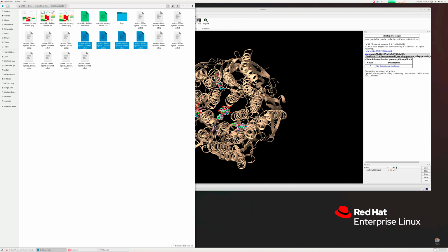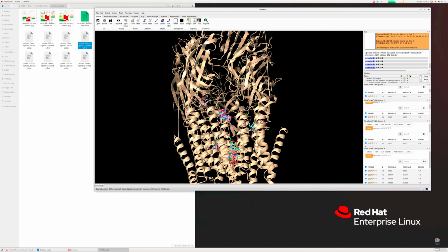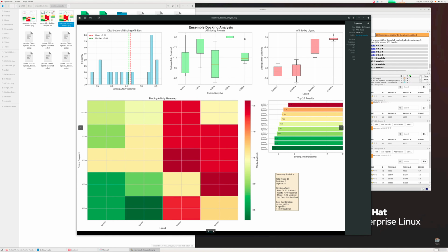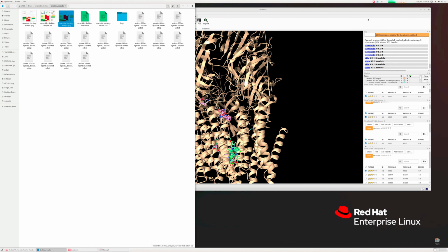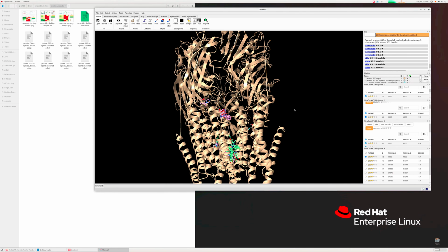You can load all of them together, and you can see here you have this minus 8.7 scoring. This is minus 6.7, this is minus 8.7, and you can pinpoint that particular one, and you can refer from the plotting as well. So minus 8.70, which is your protein 800 nanoseconds plus your ligand 4.